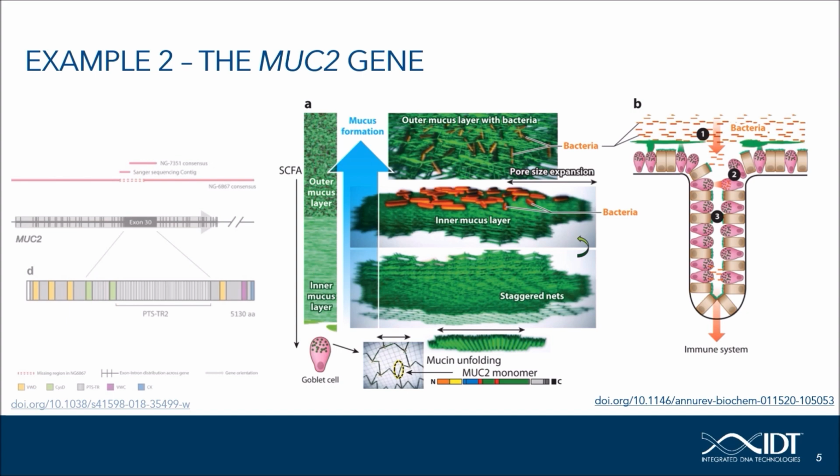And that's what we're interested in, and that's what we're doing research about. So if there would be a technology that could facilitate an accurate and high throughput analysis of the MUC2 gene variation in a larger set of cases and controls, we could definitely better test for an implication of this gene in disease.